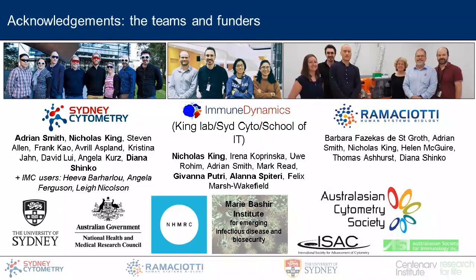Thank you. So you did touch on it in the last part of your talk, but any further thoughts on what is the future for computational analysis and cytometry, and how could the existing tools and approaches be improved upon? I think where a lot of this kind of work needs to go is in the capacity of the goals of things like the Human Cell Atlas.